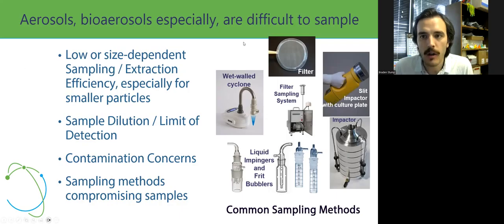And you'll see on the right here a few different common aerosol sampling methods, and they all have their benefits, right? They've all been utilized before to great effect. But you can understand that throughout that process they would have some difficulty in sampling that would require there to be a need to be filled.